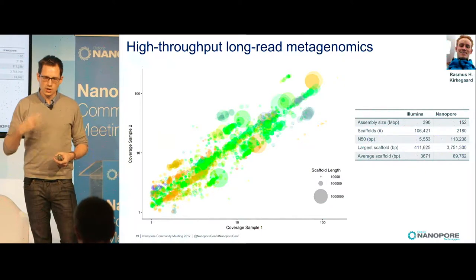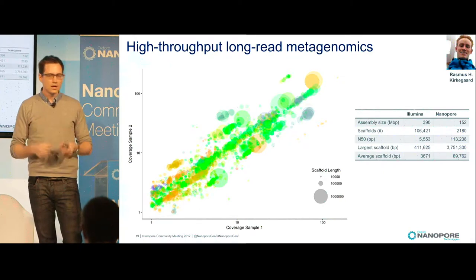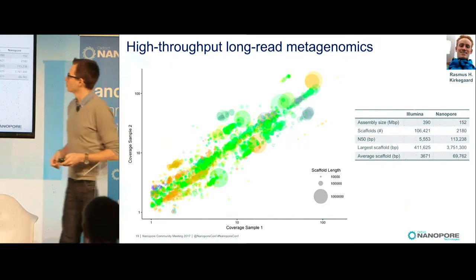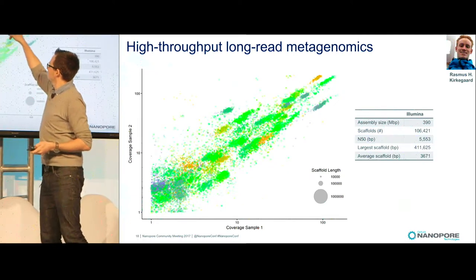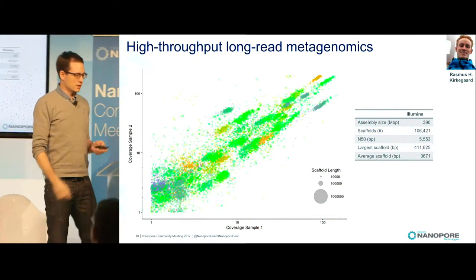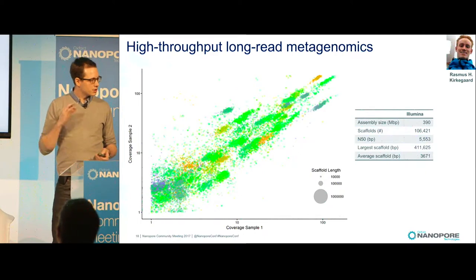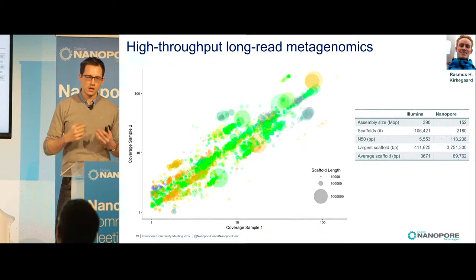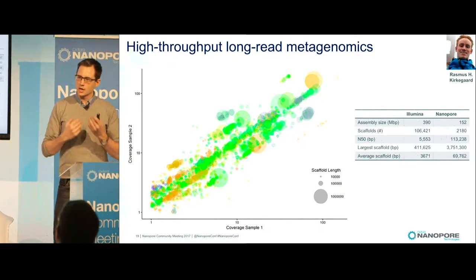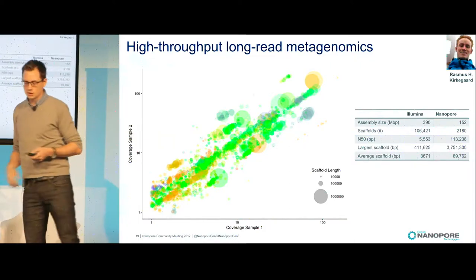So just turning it the other way, starting from long-read data and assembling that, we start to actually reconstruct many of the genomes. And what you can see, hopefully, here is there's also some fun thing happening. Up here, there are small pieces, small contigs assembled, but really not much data. And this is one of the most abundant bacteria. We don't see it with the Illumina data. And that's basically because of strain variation, so many closely related strains. But it seems like when we actually start to add the long reads, we change this strain problem to something else. And we actually start to be able to assemble the complete genomes again.